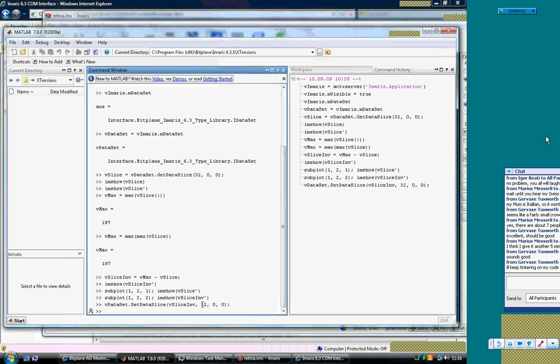When you get the indices, you can always add one before working in MATLAB, and then subtract one, or always know that you have one less when you want to set them. Personally, I prefer not to change them, but you can do what you prefer. Just be sure you don't add one to the intensity or to the coordinates, because these are common errors.